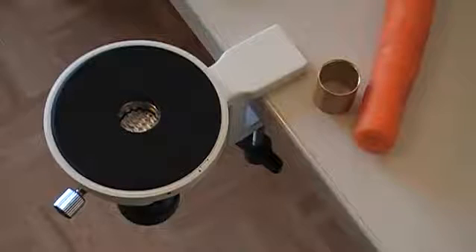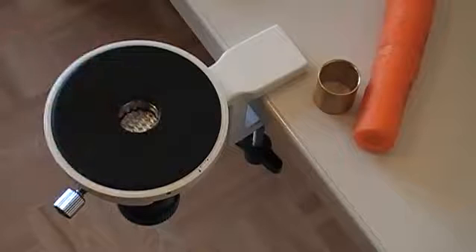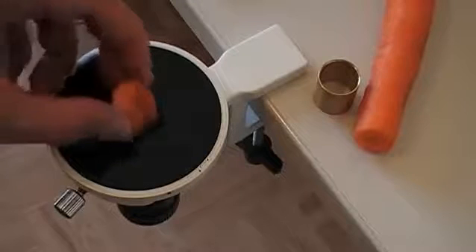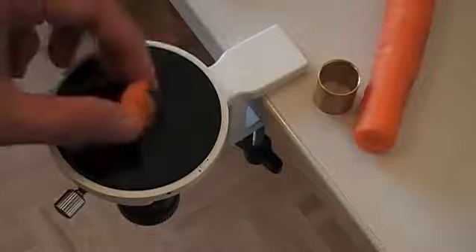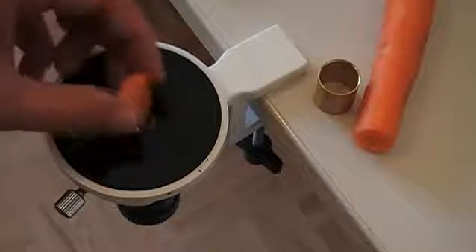I've now mounted the microtome to the table with a clamp, and in the hole in the center over here, I have to put the specimen to be sliced — in this case, the carrot. Now, if you make little carrot pieces like this and try to put them in here, they're not going to stay in place. They're too small, it's kind of unstable, and it's impossible to cut it properly.